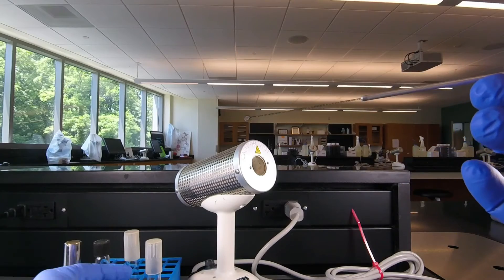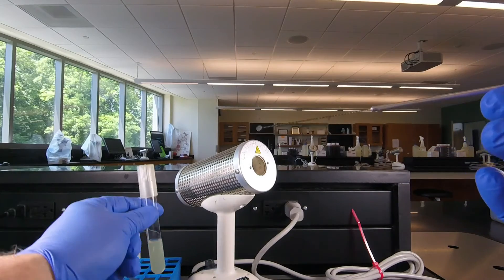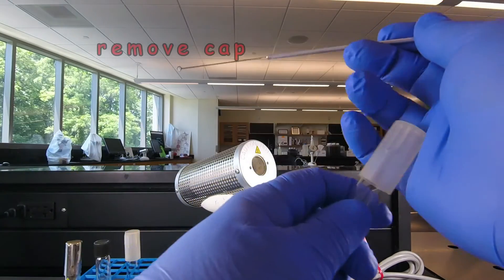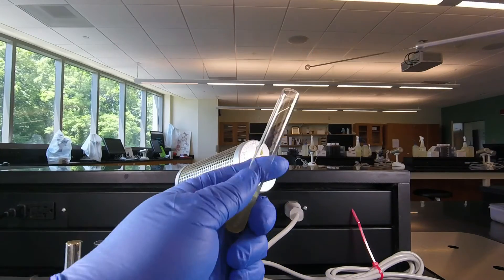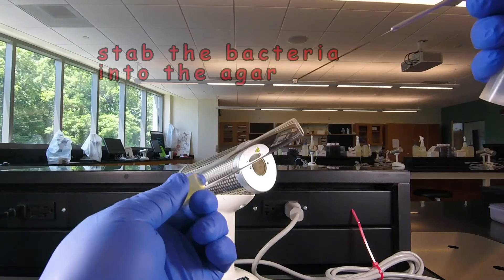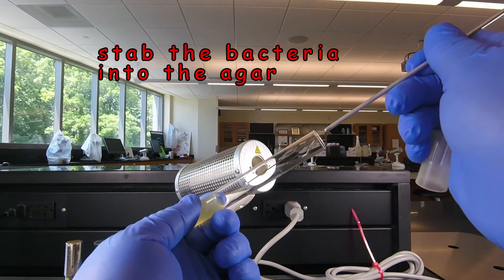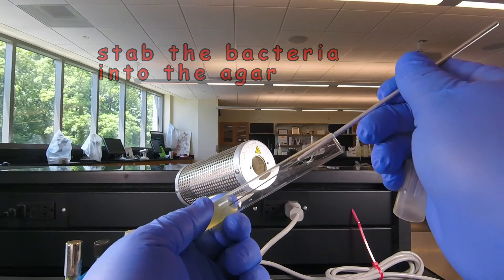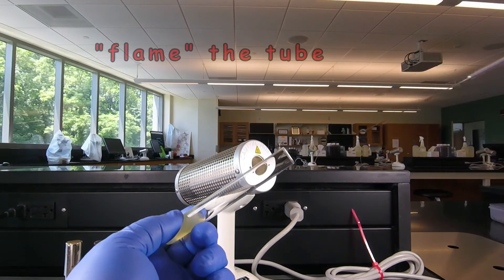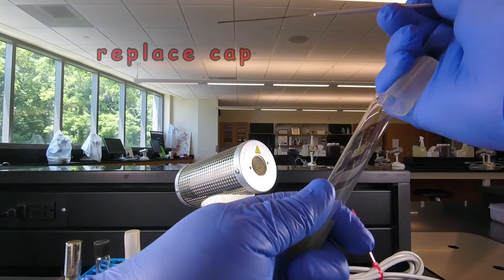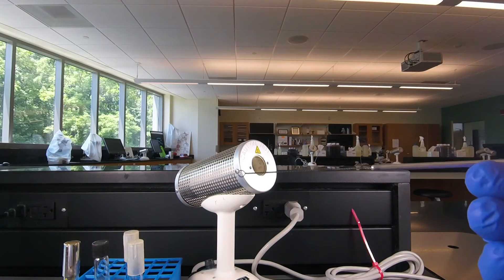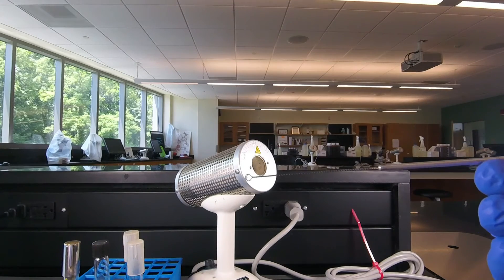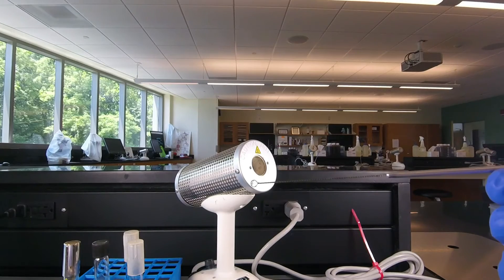Then pick up the stab tube. Remember pick it up by the glass not the cap. Remove the cap. Flame it for three seconds. And then we're going to stab right down the center of the tube about half to three quarters of an inch like that. Flame for three seconds and replace the cap. In this case we use a loop for the stab tube. Sometimes a straight wire is used instead of a loop.